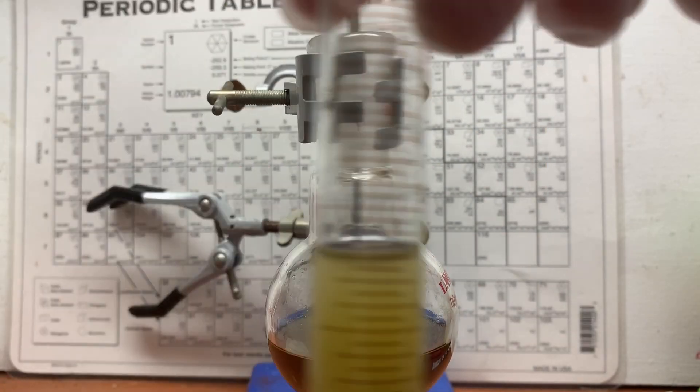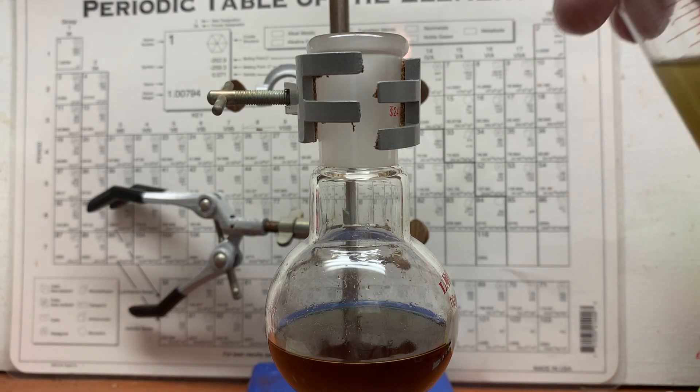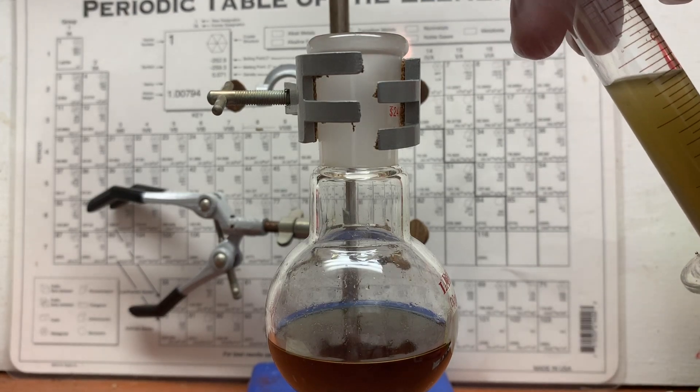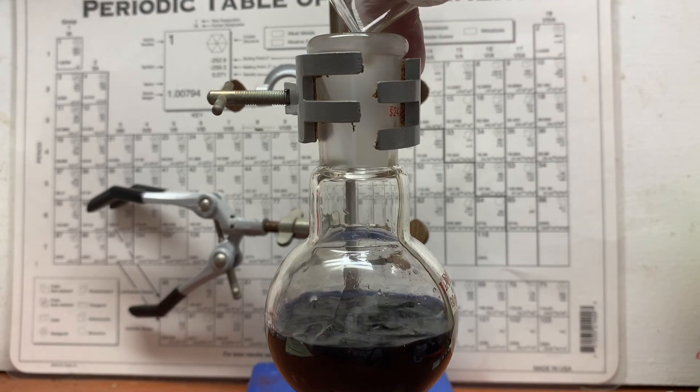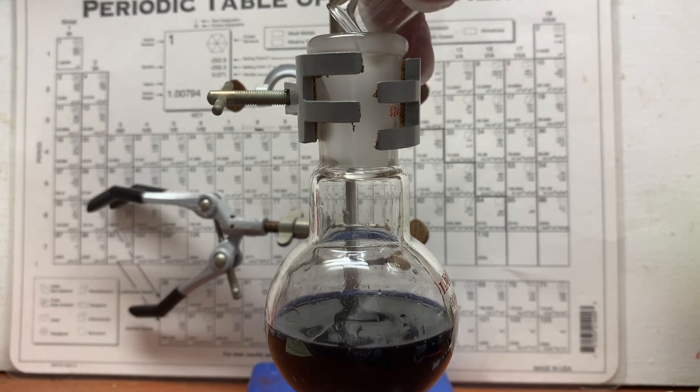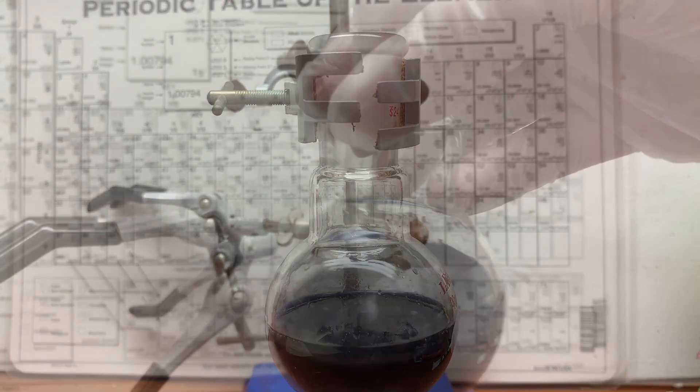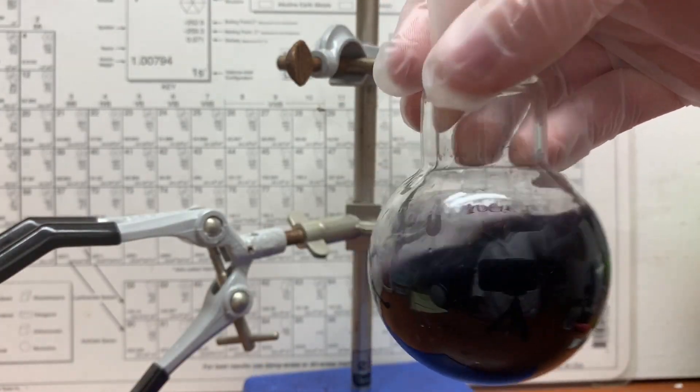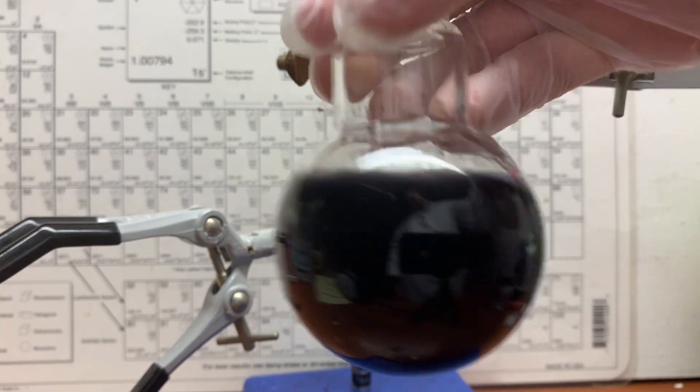Now for the really fun part, the color change. So what we're going to do here is add the ferrous sulfate solution into the tannin solution. What's happening here is the polyphenols are chelating the iron two ions, but since this is an unstable oxidation state, it readily oxidizes to iron three and it gives you this really nice coordination complex.